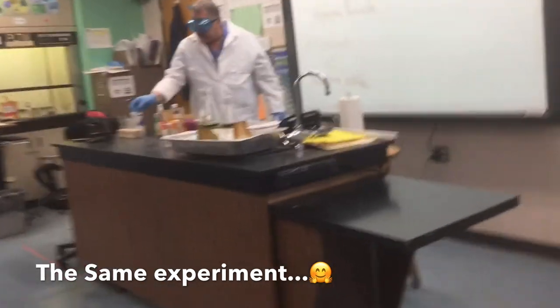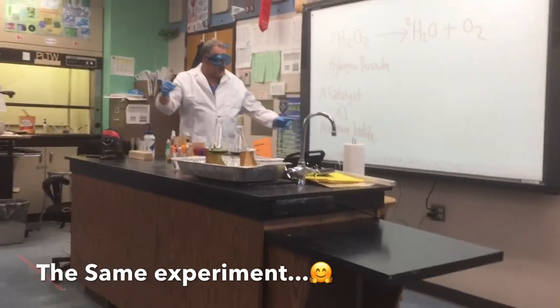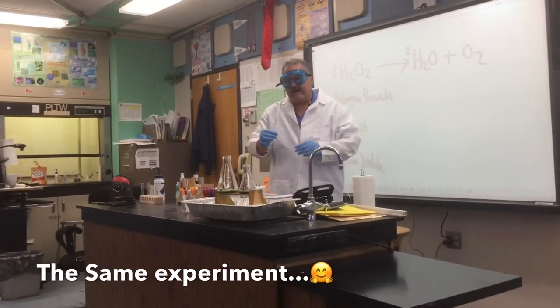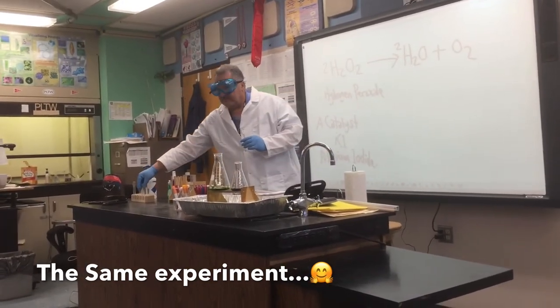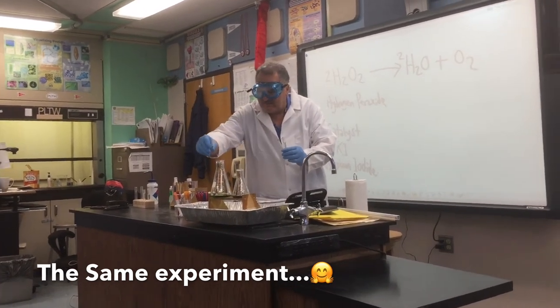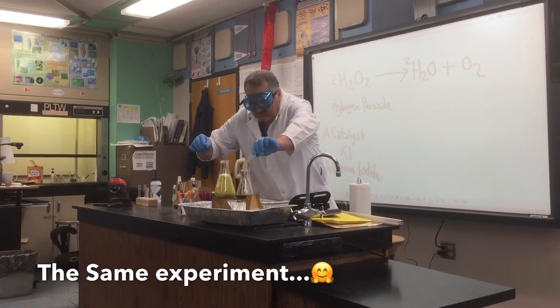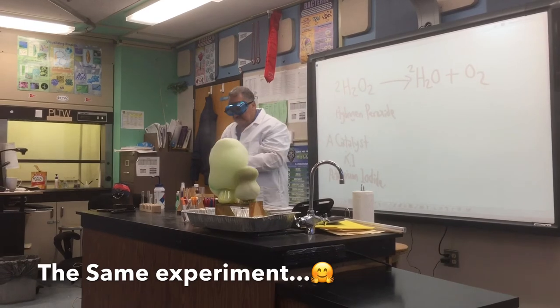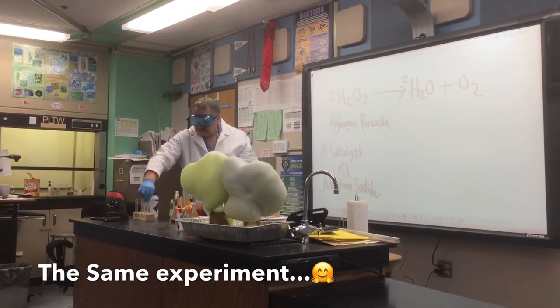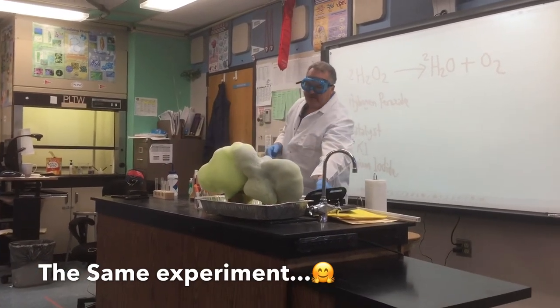Okay, so here it is. I came early in the morning and prepped this chemical here. This is the catalyst. You're going to miss it. Okay, go. Ready, go. Woo! You missed. Whoa. It's burning. The heat tells you that, is it exothermic or endothermic?